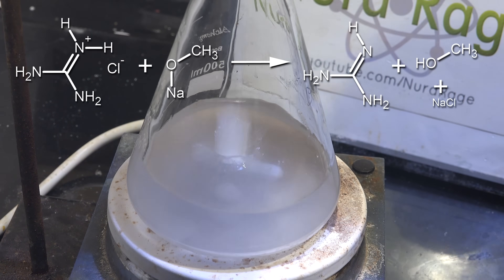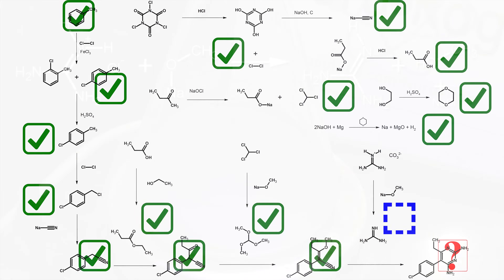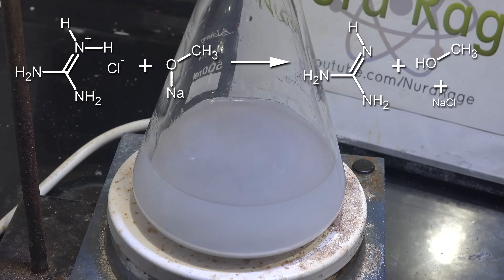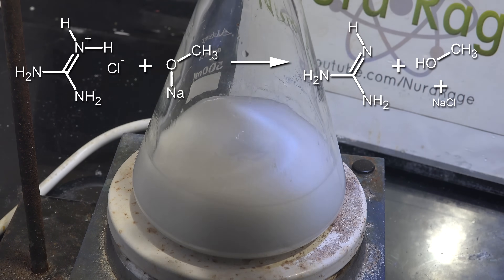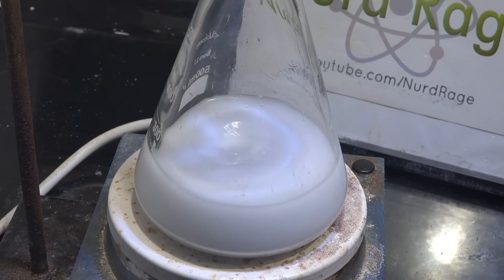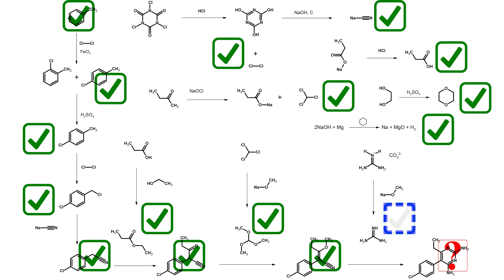We're reacting the sodium methoxide with guanidinium chloride to make guanidine and sodium chloride. For those examining my pathway closely, you'll notice I've been planning to use guanidinium carbonate rather than guanidinium chloride — I was hoping to use guanidine straight from the relaxants but was worried they weren't pure enough, so I converted them to guanidinium chloride. Both compounds will work; use whichever you have access to. Now that we have the guanidine solution, we have cleared the last precursor step — only step 7 remains.